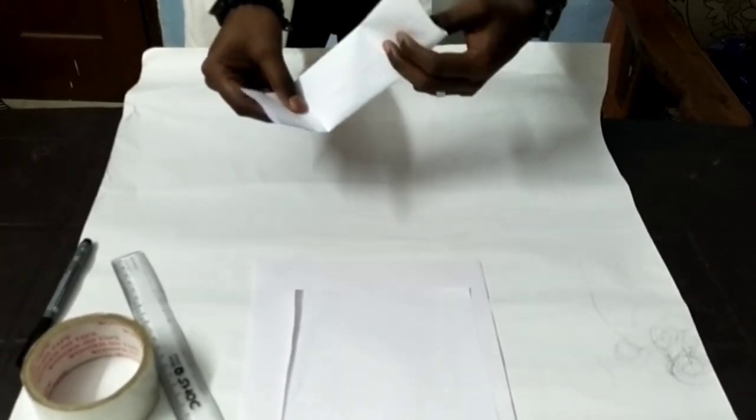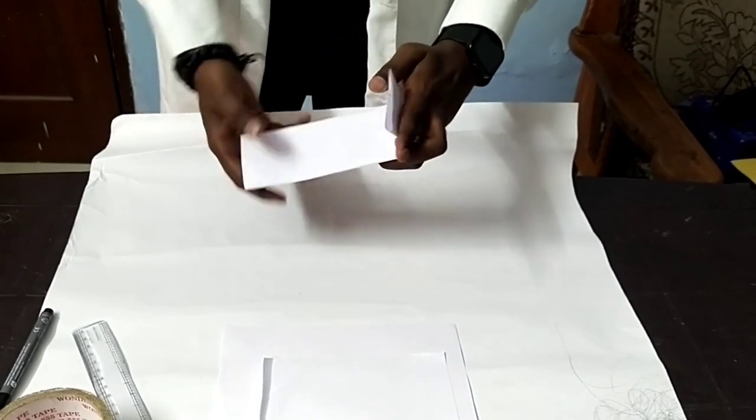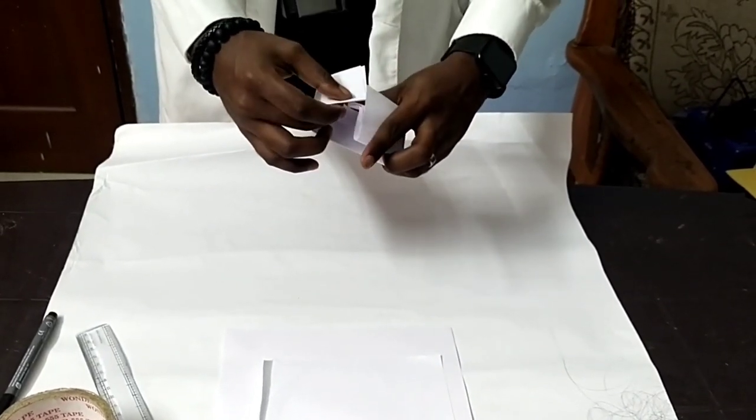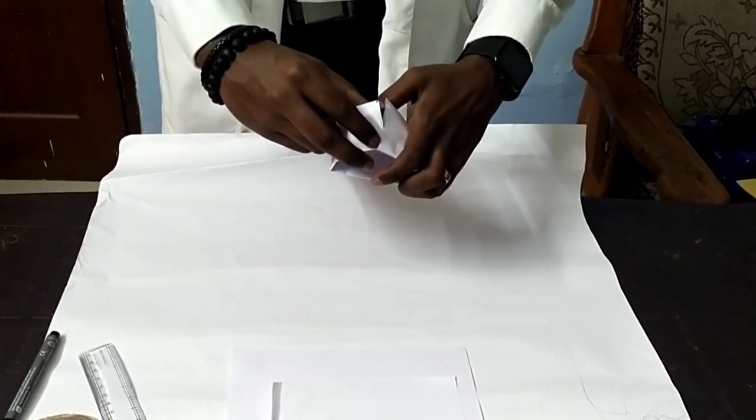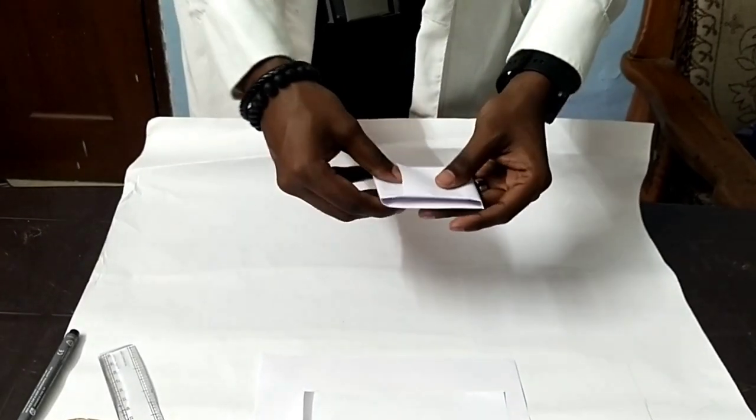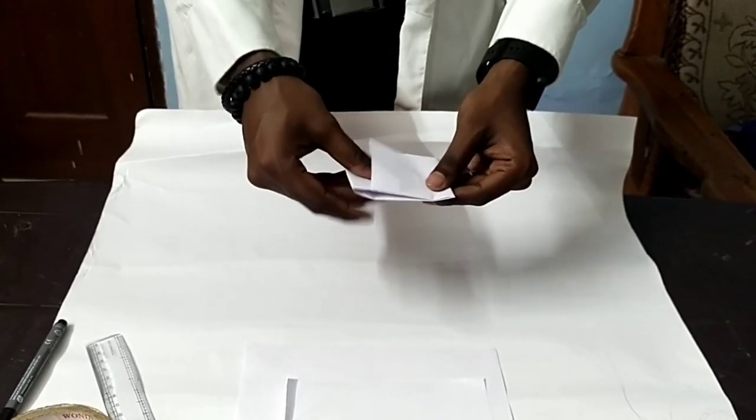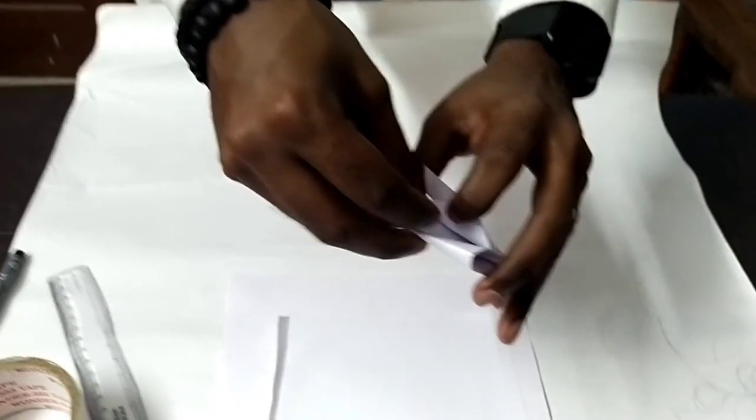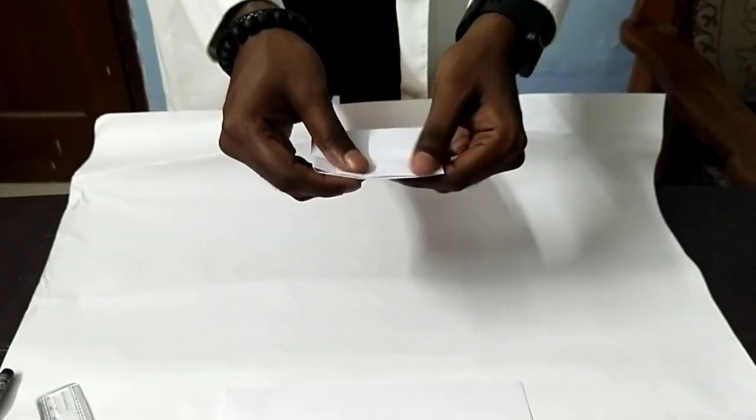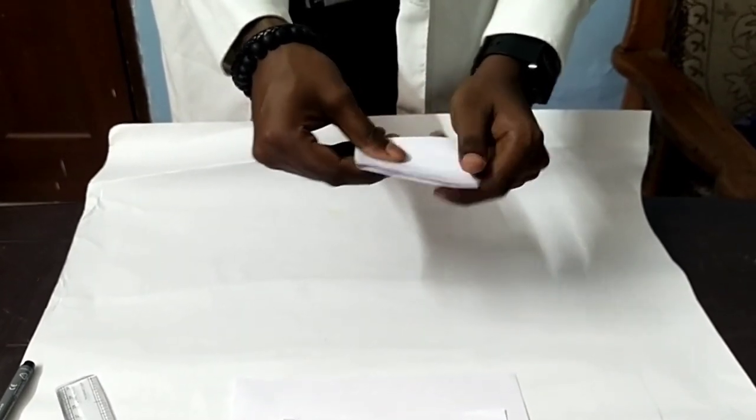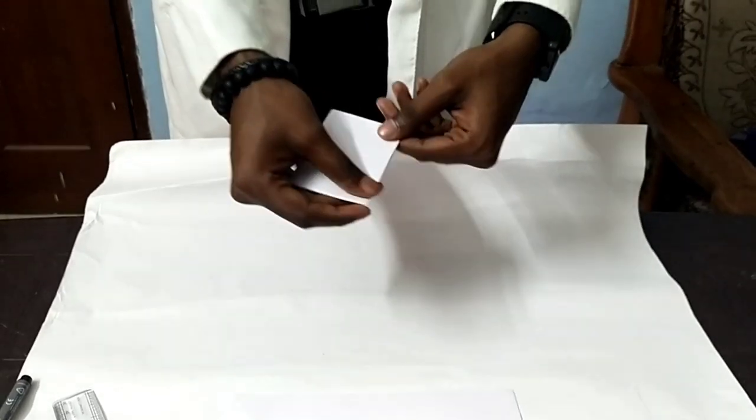Now fold the remaining triangle over the first fold, creating a smaller triangle pocket or packet. So now I have folded and tucked it in. You can see it. The one corner has been placed inside it. Press along the edges to secure the fold. Now you can see the druggist fold is made.